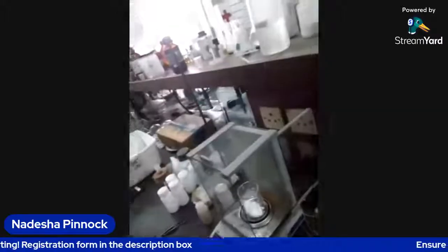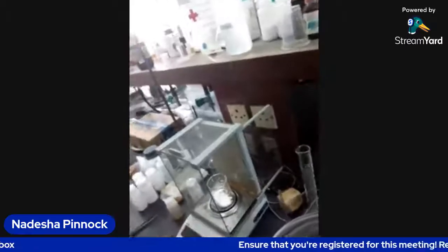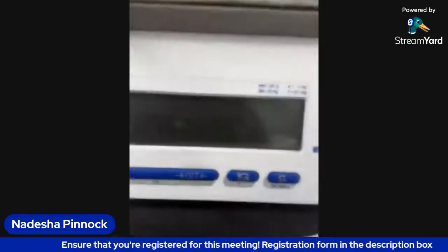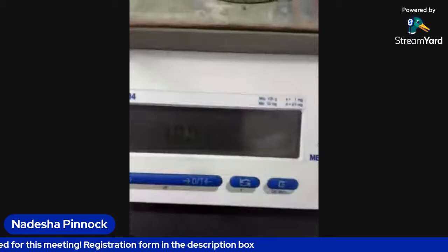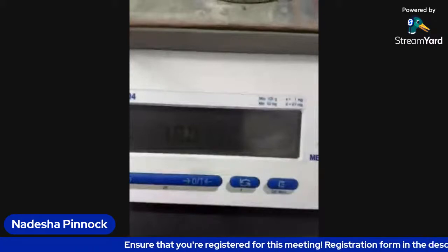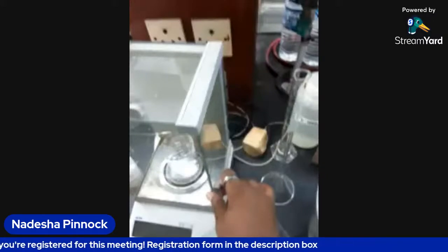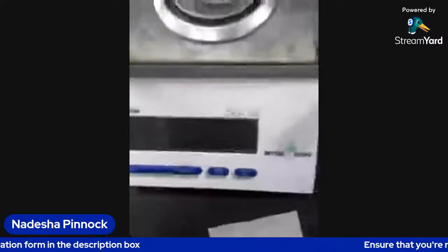Because when you are carrying out your reaction, you find that you're going to lose reactants along the way in the process. So there we have 10.07. So we are at 10.0699, which is about 10.07.